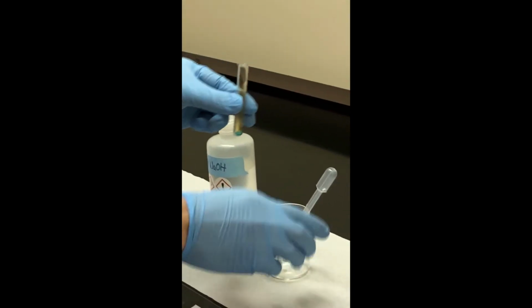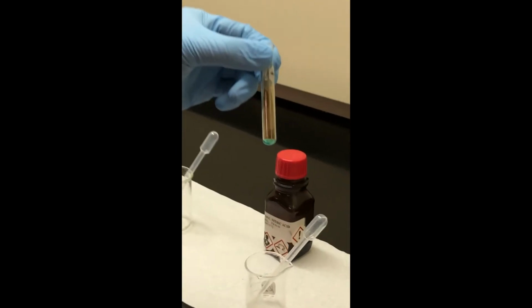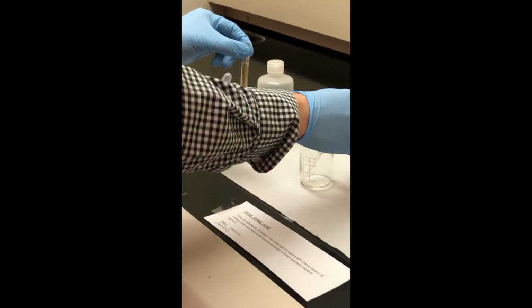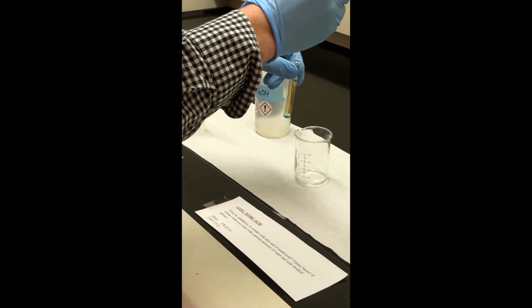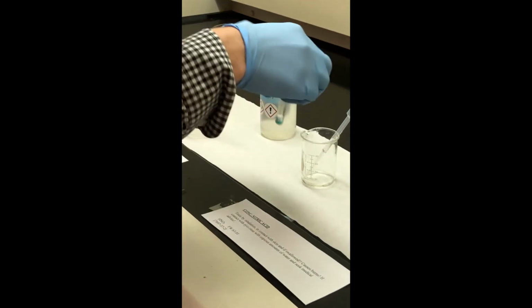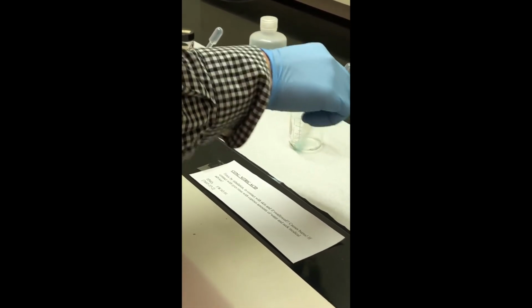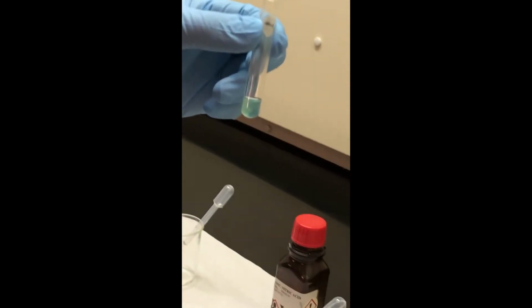I'll be adding 10 drops of deionized water. So first, please observe the color of the solution before addition of deionized water. And now I will add drops of deionized water. I will then agitate the solution. And I'd like you now to observe the color of the solution after deionized water is added.